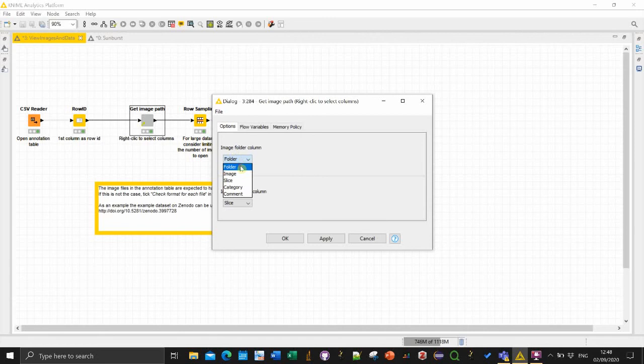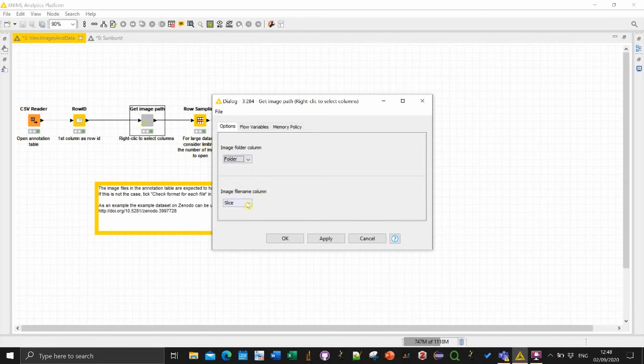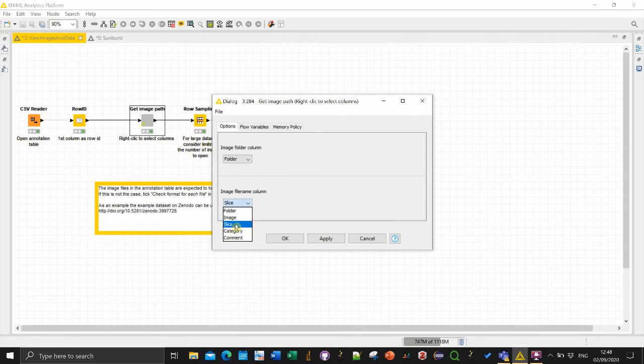While the image for the column is quite obvious it should always be folder but I still give you the choice if you actually want to rename your column you can do it. And filename in my case it's in the slice column.